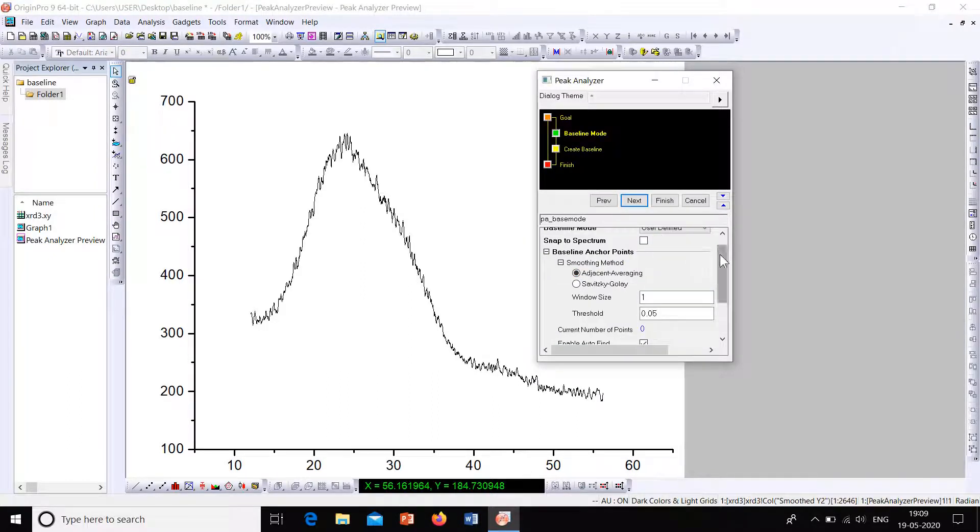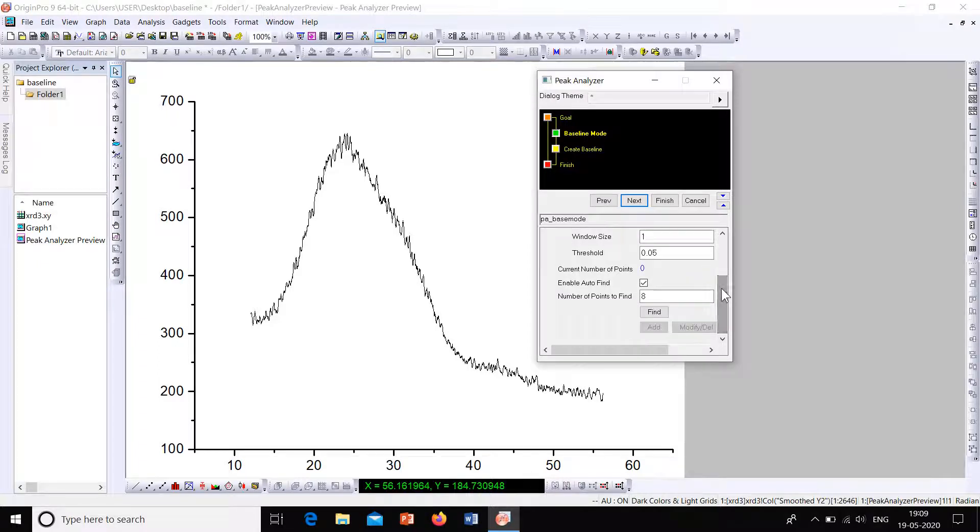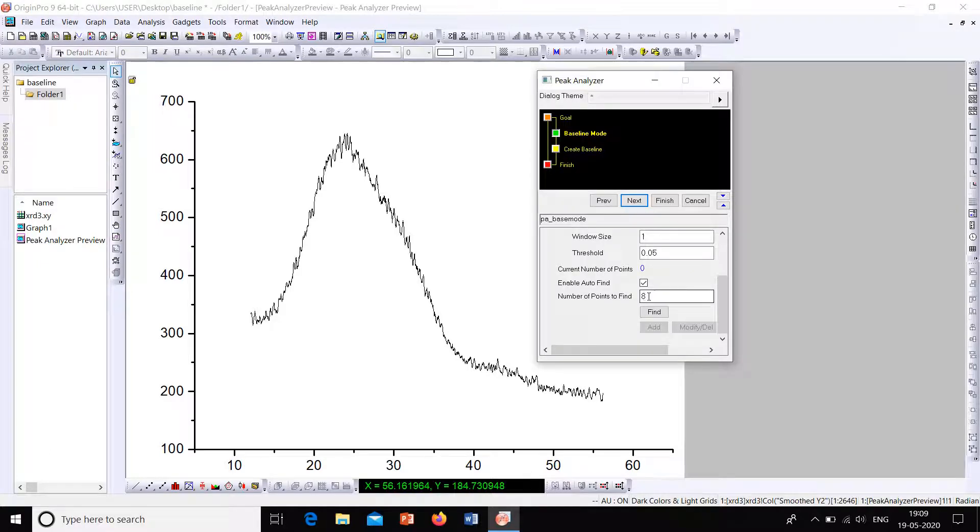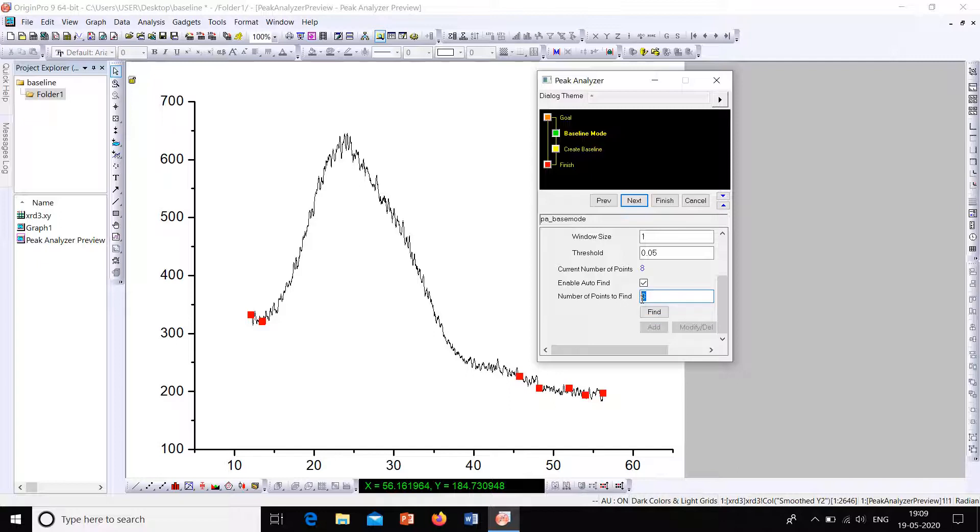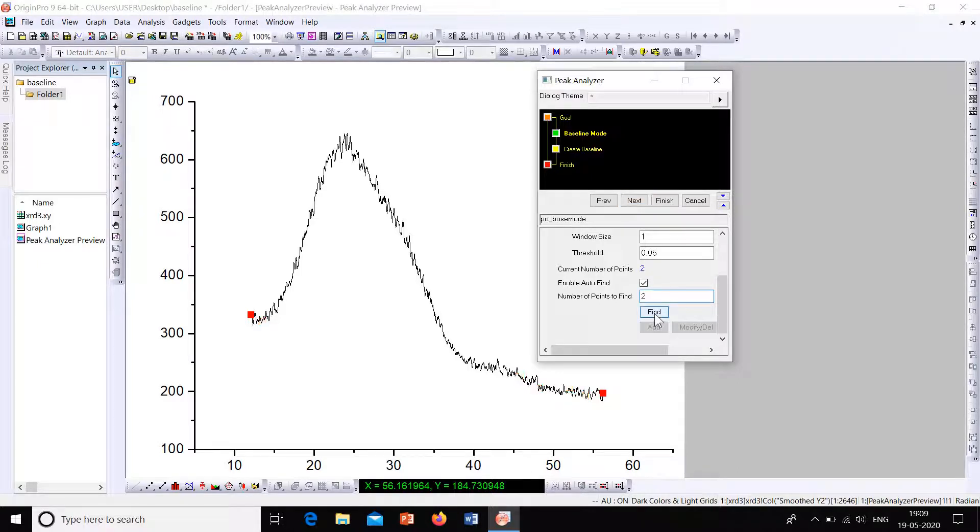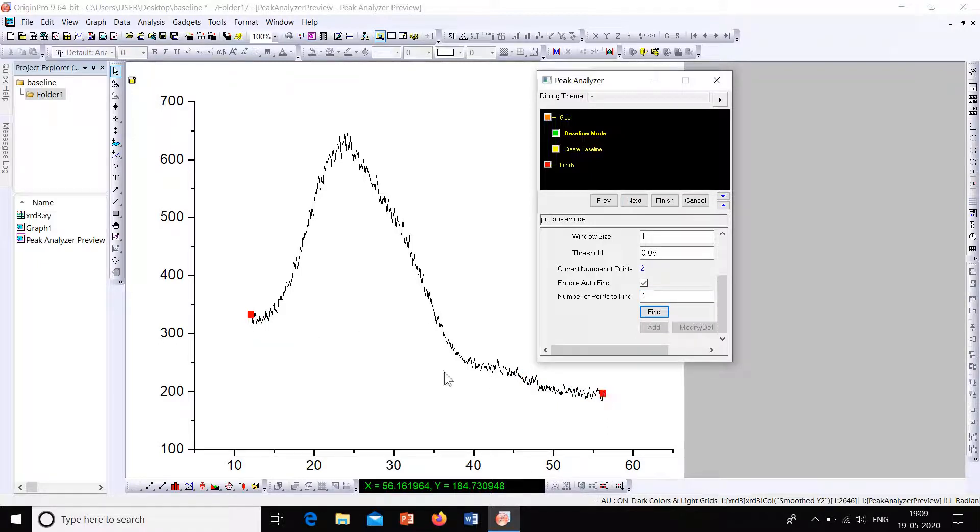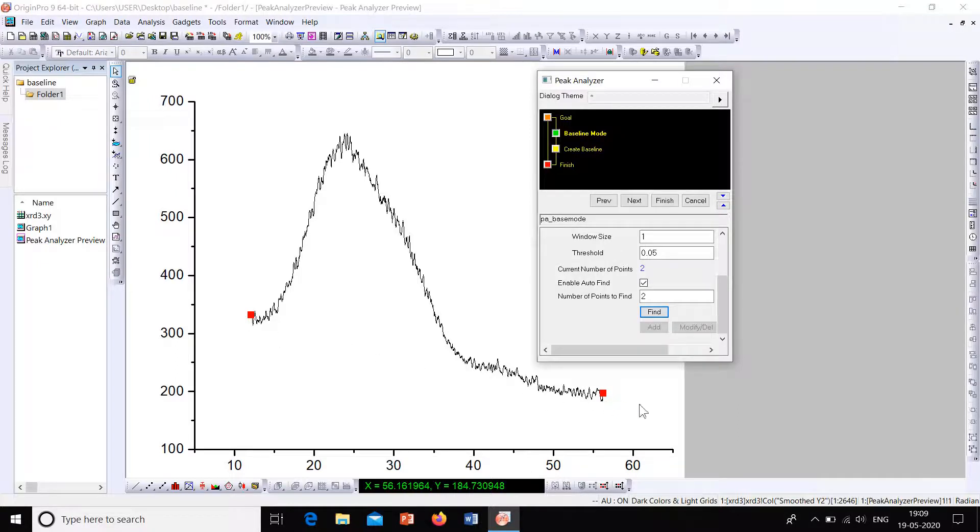So here certain parameters are shown. Here number of points to find. We can change the number of points to find. Default it is 8. So let's check how it will be if it is 8. So this is how our baseline will pass. Actually our baseline will pass through these points. So we will have a rough idea on how the baseline will look like.